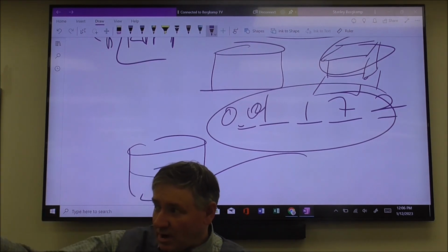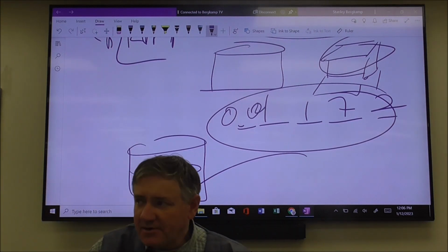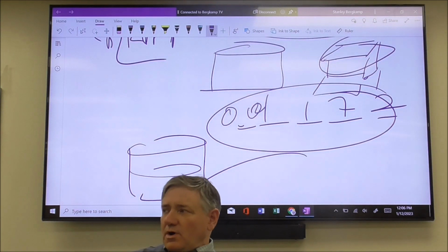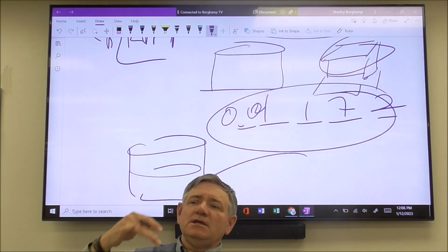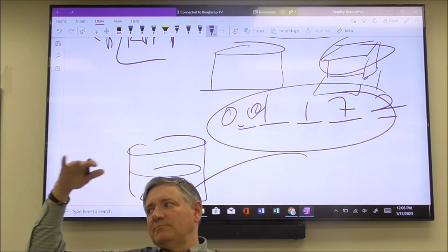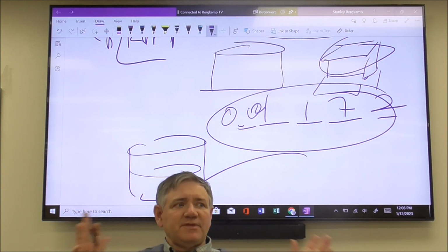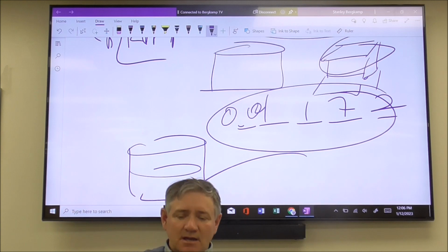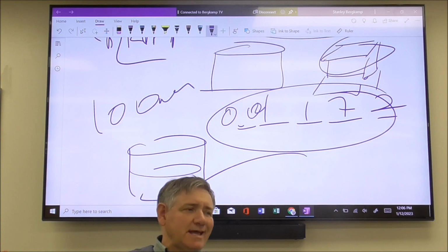Then you're going to take the water that's in an Erlenmeyer flask and it's stoppered. I've got them sitting around. And you're going to add about 100 milliliters, okay? All the water is doing is allowing the KHP to dissolve. I don't need the molarity of the KHP, okay? All I need to know is how many moles of KHP there are. This is why in the lab it says add 100 milliliters. There's no decimal point. It's just add about 100 milliliters.